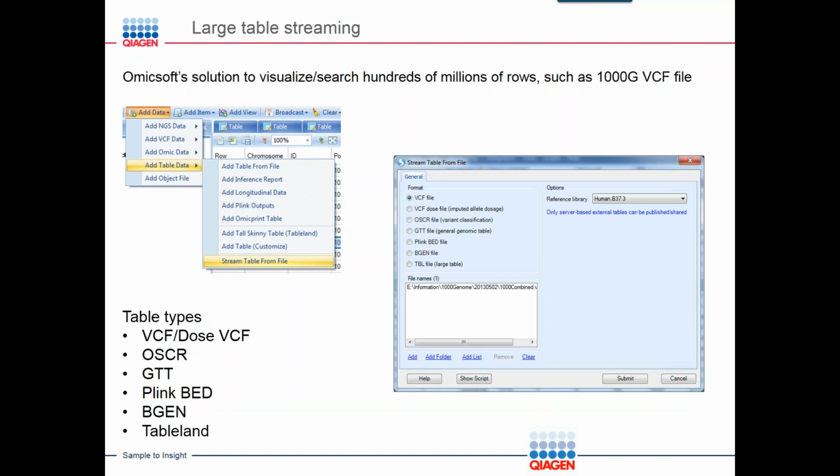And this particular gene set analysis will improve over time as well. This is because it's one of our focus. The next feature is actually a cool technology. It's probably not so much used in practice, but I think we expect that it will be used more and more.